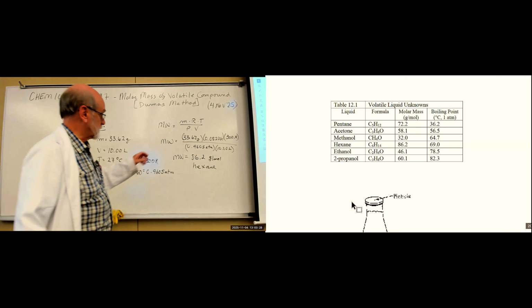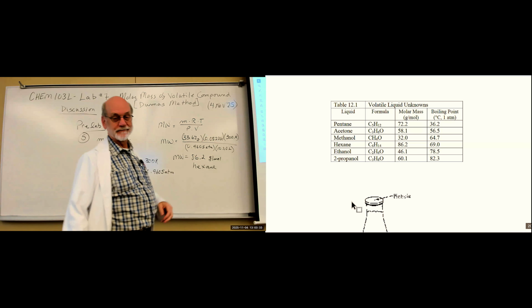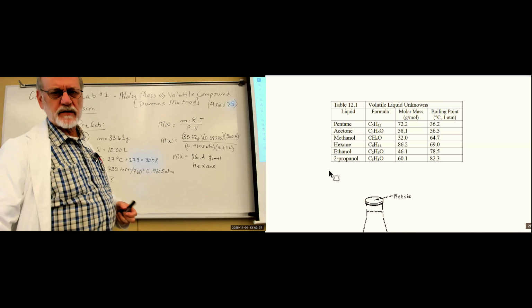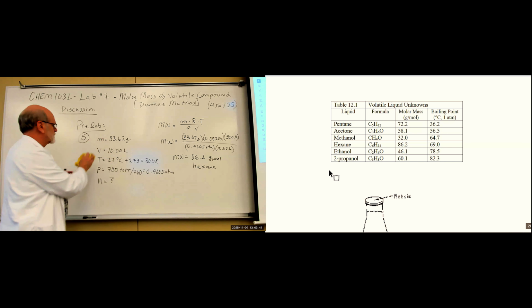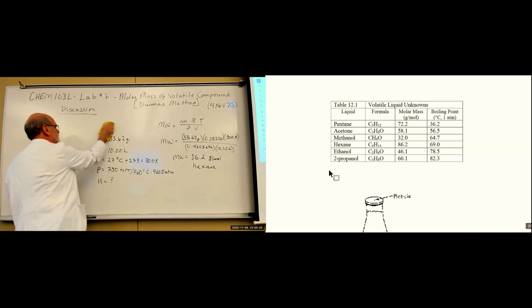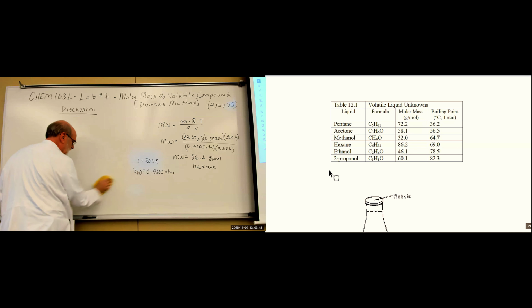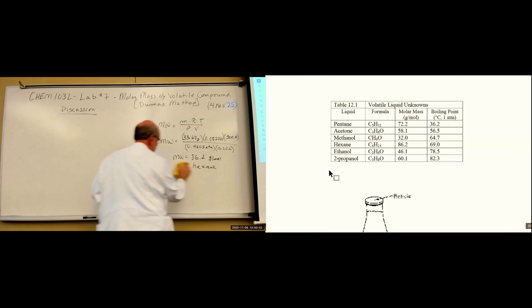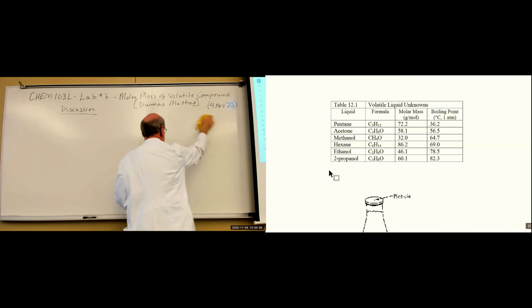What we're going to be using for this temperature is boiling water. All right. Okay. So I think that's the last pre-lab. I've got 6 volatile organic compounds, and you can just pick one, it has a number on it, and work with that one.